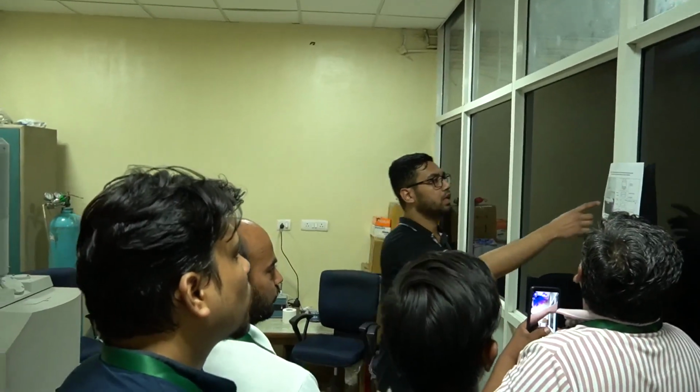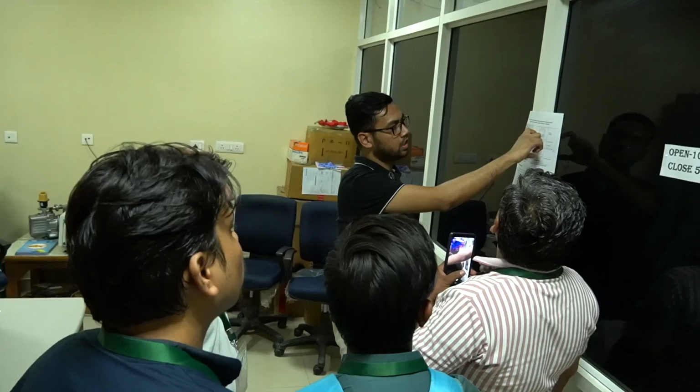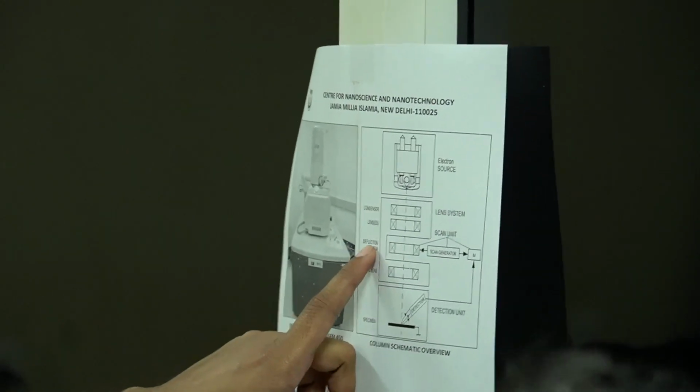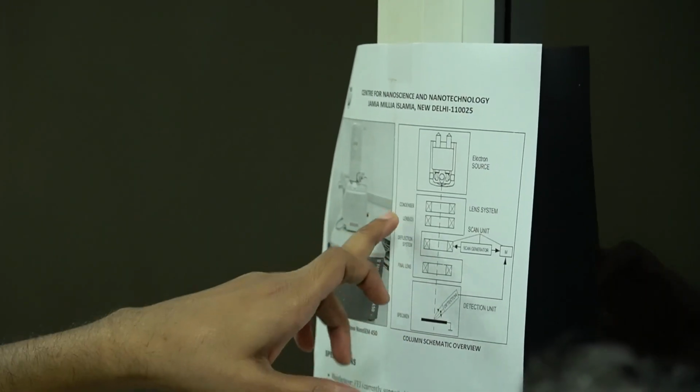Then it passes through the second section of this part. It is composed of different kinds of lenses: the condenser lenses, some deflection system, and final lenses. So the final lens is called the objective lens.